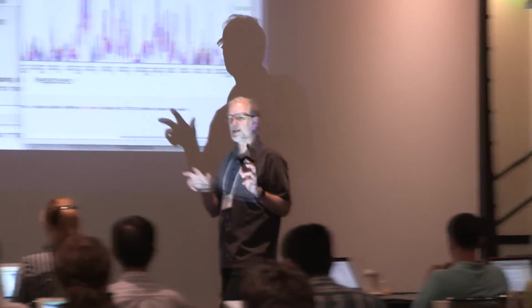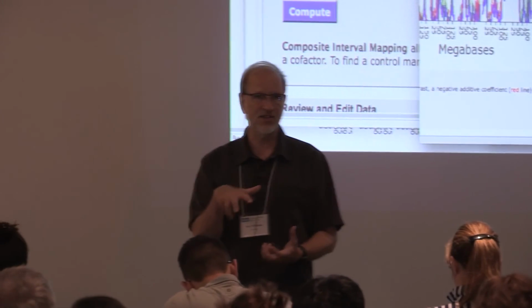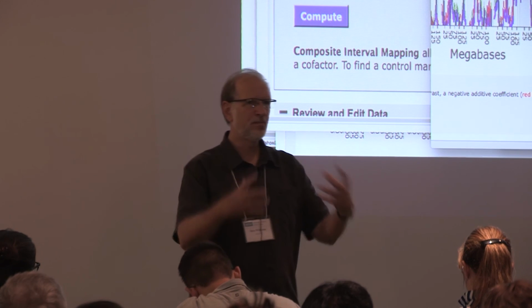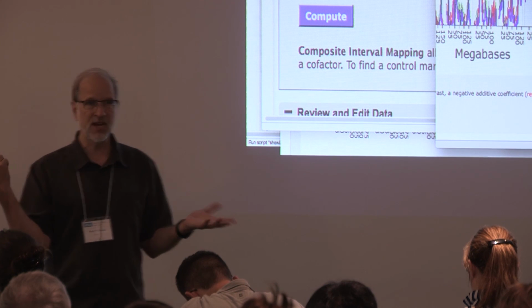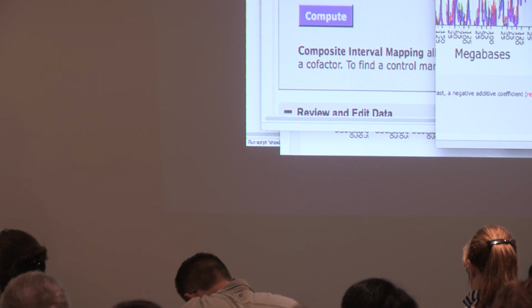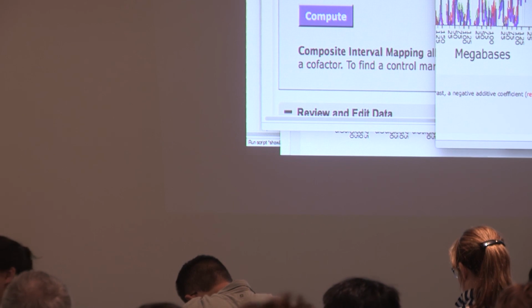Okay, so you guys should have a pretty good feel. You now understand mapping to some extent. What we haven't done is really network analysis, and that's what I want to do tomorrow. So tomorrow will be really bringing bigger batches of traits together, computing eigengenes. So GeneNetwork computes eigengenes beautifully, very rapidly. You get as many PCAs as you have subjects that go into the analysis.